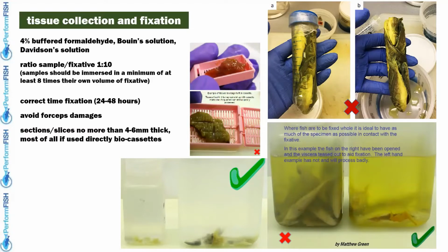Also for the histology involved in the project, there is a protocol, but as we see in this picture, the guidelines given were not always followed, probably due to the inexperience of the staff. Here you can see, most of all in this picture, what I mean, of course.